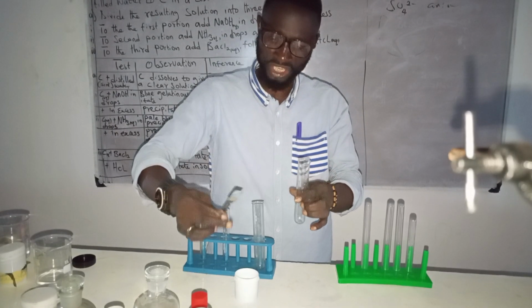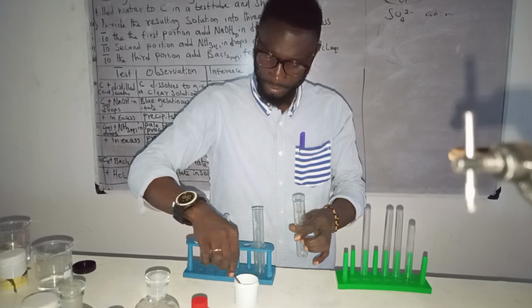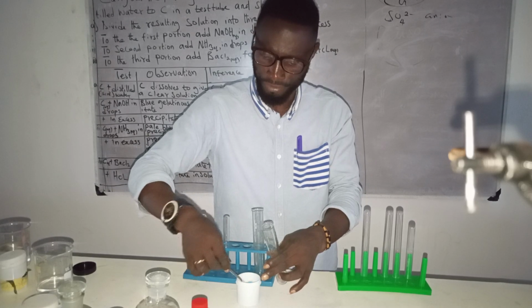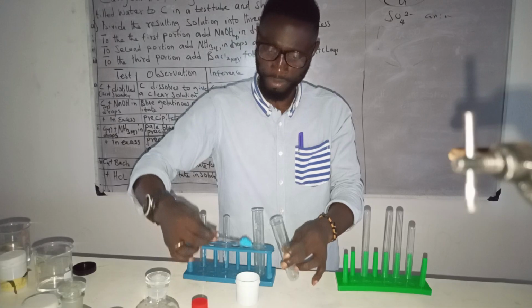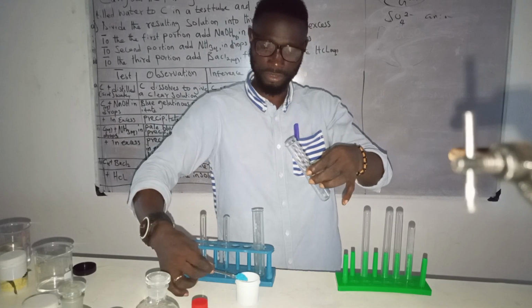Copper 2 sulfate, you dish out a spatula full. Okay, it should be full. Dish it out into the test tube.